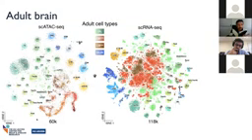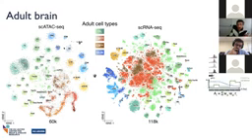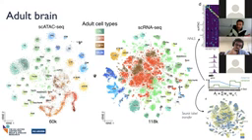So in the adult, we have found, after a cisTopic analysis, quite specific clusters. And this is the RNA-seq data. And we were able to link many of these clusters to specific clusters in the single-cell RNA-seq data, and thereby transfer the labels of the RNA-seq to the ATAC-seq. So how do we do that? By several approaches, but they're all based largely on aggregating ATAC signals with some function on the genes, so that we have a gene value for the ATAC-seq data that can be integrated with the RNA-seq, which is also a gene-based value. And then we can use NNLS or integration using Seurat for label transfer.